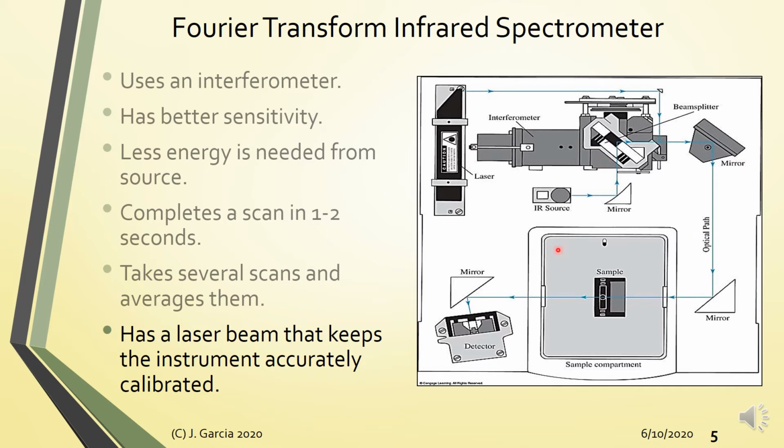Now, FTIR is a very powerful instrument because it will enable you to analyze a wide range or variety of samples.